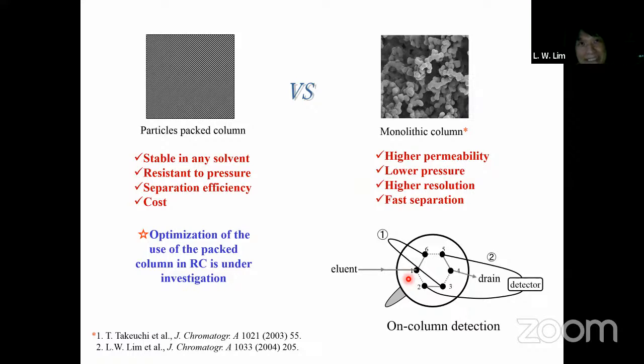That's why for HPLC, when you choose the eluent, you have to buy HPLC grade so that you can avoid the background, especially for a fluorescence detector, something so sensitive like fluorescence. Even for UV, sometimes if your separation requires very high sensitivity, and you use the usual methanol or the usual acetonitrile, which is quite cheaper, then your background noise sometimes is not so good. That's why you have to use HPLC grade eluent.